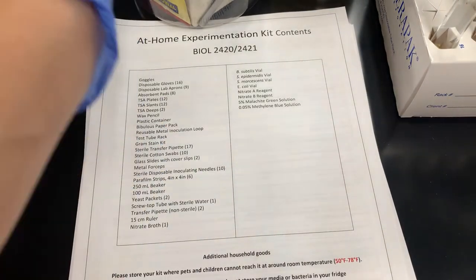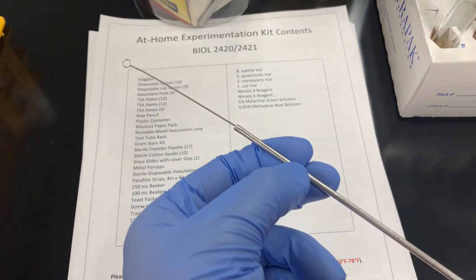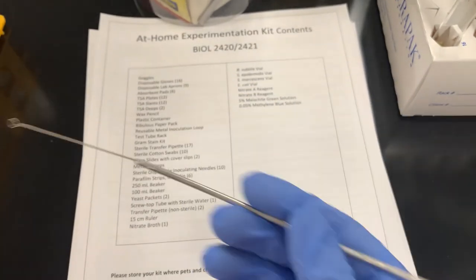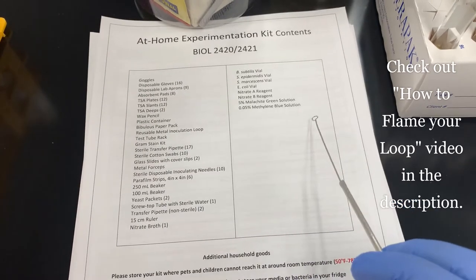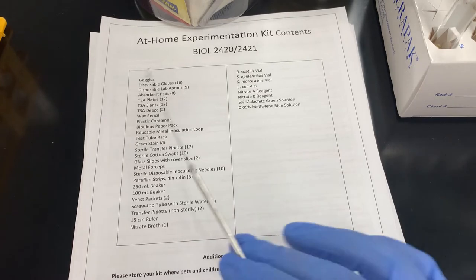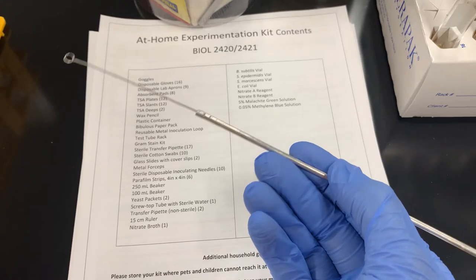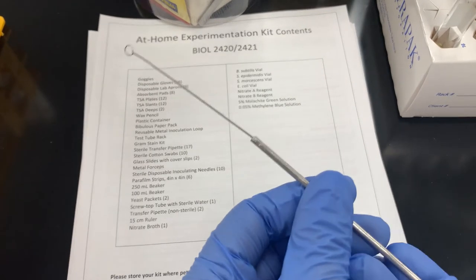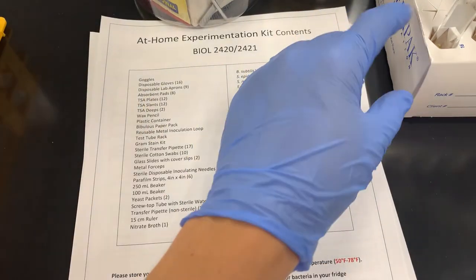Reusable metal inoculation loop, right here. This is reusable, do not throw this away. This is your lifeblood. Okay, you're going to hold it like a pencil, just like a pencil. You're going to, sorry for the shakiness, dip it into the ethanol that you're providing and then hold it over a candle so that it gets sterile so that you can aseptically transfer bacteria and grow bacteria. Do not throw this away. It is reusable, it is not disposable. Next is your test tube rack that you saw earlier.